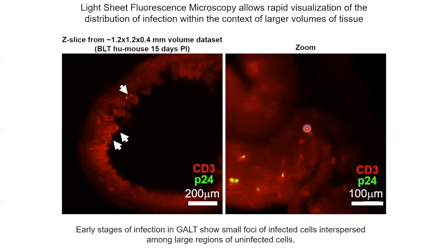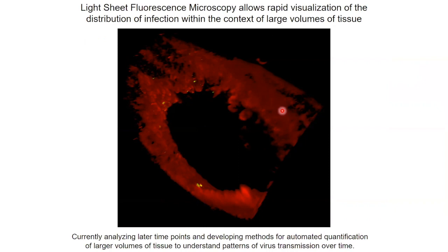And so this is just a 3D model of that. We can start to make an entire 3D model of, let's say, about a half millimeter by 2 millimeters by 2 millimeters, and we can start to tile these together, where you can move your scope of imaging to several millimeters to several centimeters along a single sample.